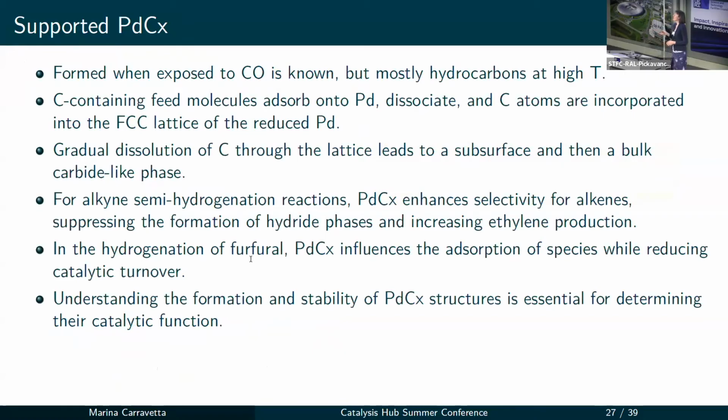Now, palladium carbides are actually important for a lot of processes, and we were very keen to determine the chemical shift of the carbon in this environment to utilize that for further studies. Therefore, what we tried to do was to devise a method to insert carbon-13 in the system in a way that was cost-effective in order to be able to follow it, because the applications are significant and diverse.